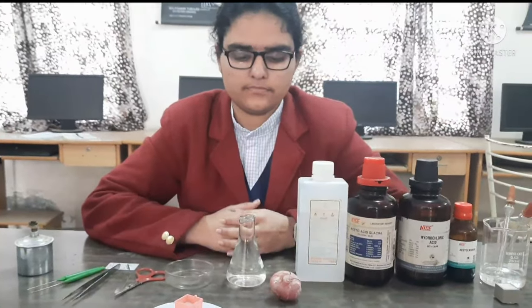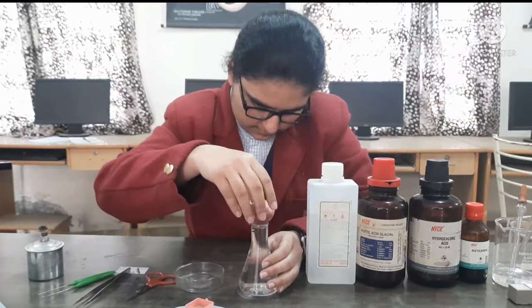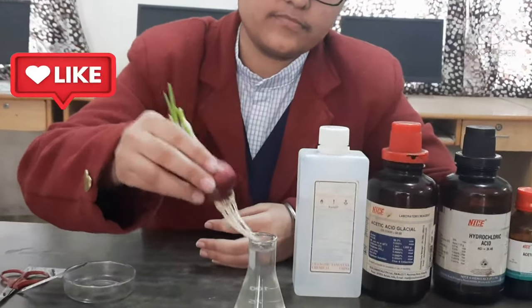First of all, take one onion bulb and keep it in a conical flask filled with water for two days. After 24 hours, roots will grow like this.